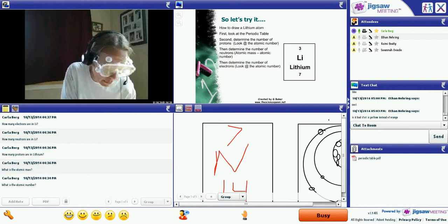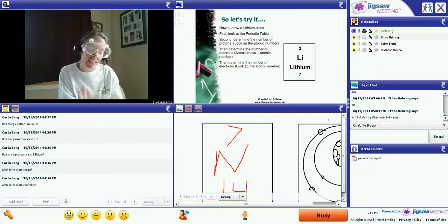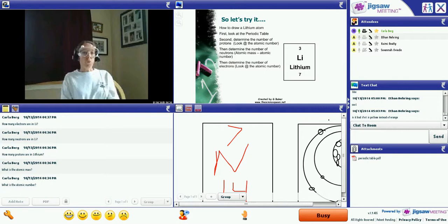It's been 3 minutes on my watch. So just take a look at them. What we are eventually going to do is see if we can find a precipitate, which is like a little bit of material that has settled to the bottom. It precipitates very slowly.